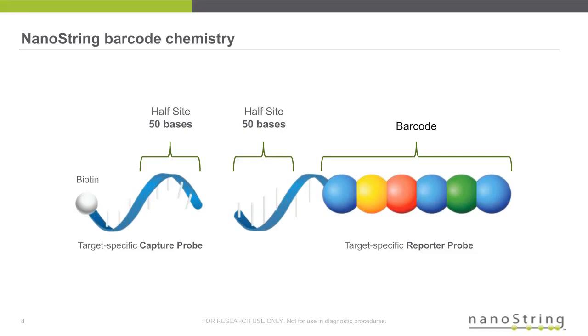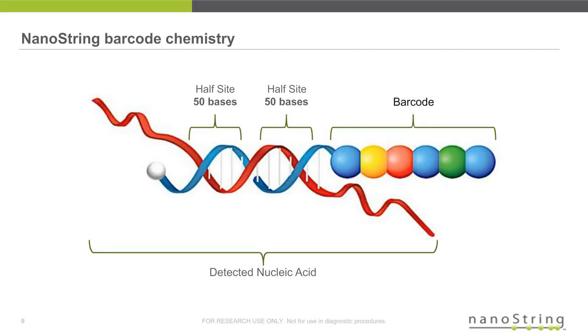If, for example, we're analyzing RNA, we take those probes and mix them with the RNA. The RNA then binds to the specific target sequences that are designed here and here. And when this complex comes together, we can then count the number of times that RNA is present in the sample. You'll notice I didn't say anything like reverse transcription or PCR. In these applications, you're directly counting the molecules from the lysed sample.